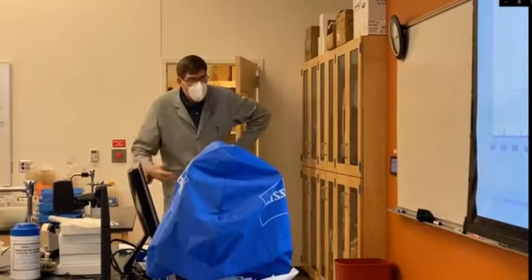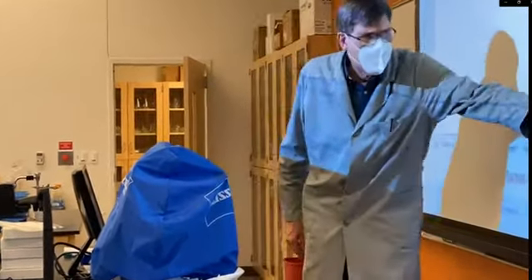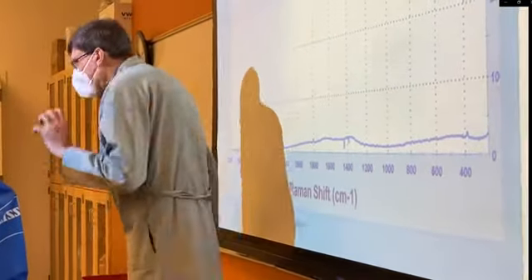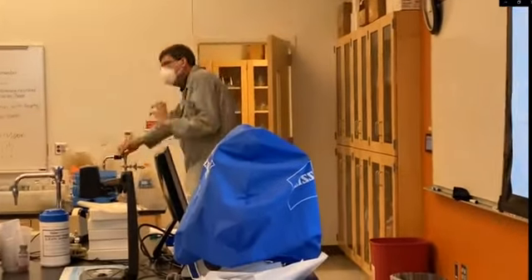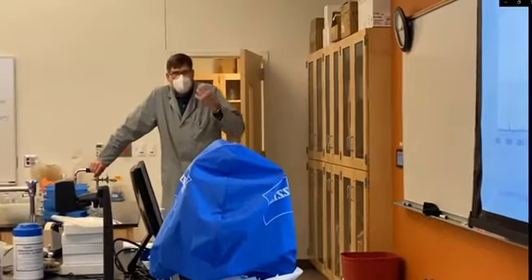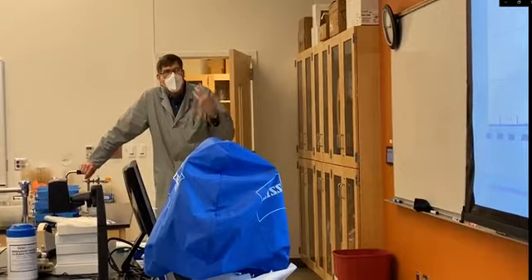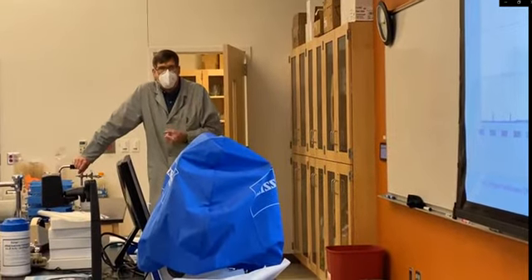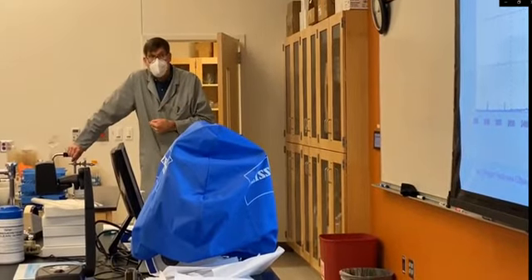So it is much easier now to measure the ethanol in water because at the wave number where ethanol responds, we have essentially no signal at all from water. And that way we don't have to subtract out or try to remove the interference from water. It's much simpler to measure the ethanol in the presence of water using Raman versus mid or near.